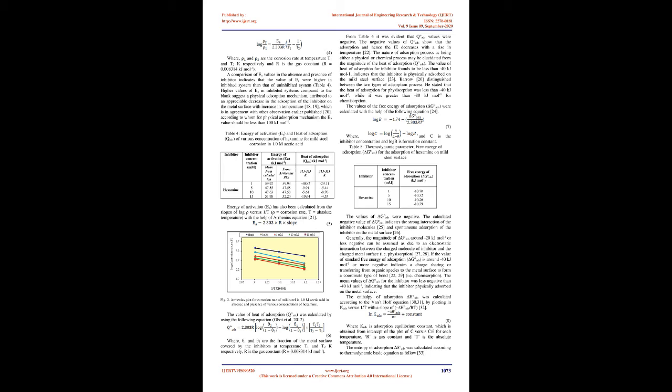D. Temperature effect. To study the effect of temperature on corrosion of MS, the test specimens were completely immersed in 230 ml of 1.0 M acetic acid solution without and with different concentrations of hexamine at 313, 323 and 333 K for 2 hours. After the exposure period, the test specimens were weighed to determine corrosion rate. From the weight loss data, inhibition efficiency, energy of activation, EA, heat of adsorption, Q ads, free energy of adsorption, ΔG° ads, enthalpy of adsorption, ΔH° ads, and entropy of adsorption, ΔS° ads, were calculated.